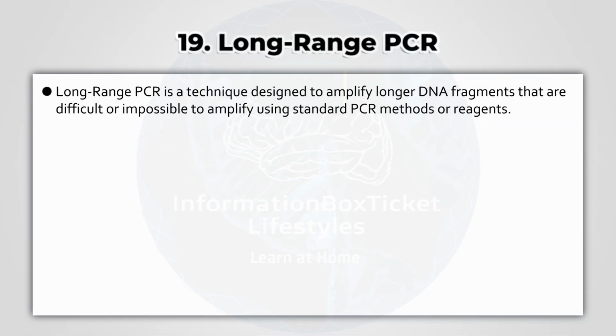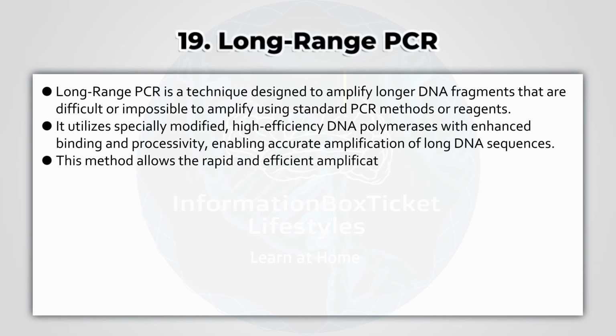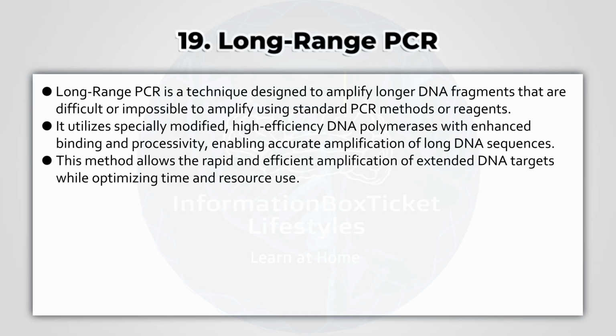Long-range PCR is a technique designed to amplify longer DNA fragments that are difficult or impossible to amplify using standard PCR methods or reagents. It utilizes specially modified, high-efficiency DNA polymerases with enhanced binding and processivity, enabling accurate amplification of long DNA sequences. This method allows the rapid and efficient amplification of extended DNA targets while optimizing time and resource use.